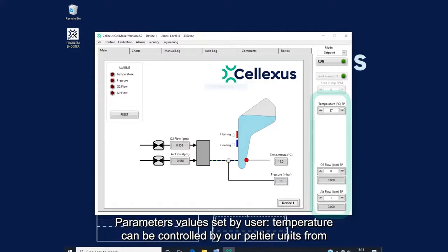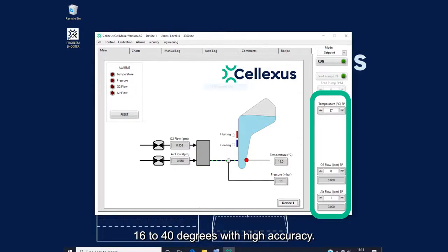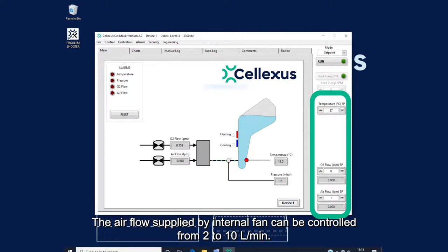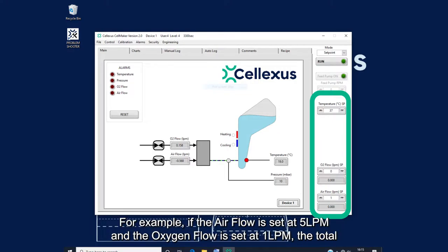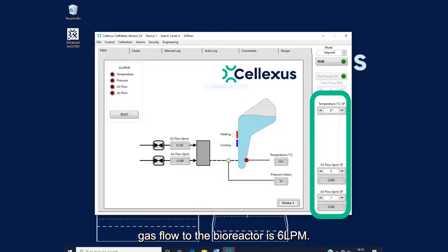Parameter values set by user. This is where temperature can be controlled by our Peltier units from 16 to 40 degrees with high accuracy. The airflow supplied by the internal fan can be controlled from 2 to 10 litres per minute, and the auxiliary gas line much the same. So for example, if the airflow is set at 5 litres per minute, and the oxygen flow is set at 1 litre per minute, the total gas flow to the bioreactor is 6 litres per minute.